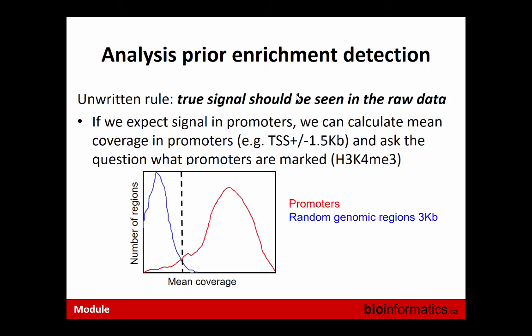It is a QC. Martin showed you the plots which have those bars, which tell us how many reads fall in the promoters of the genes. So after alignment, we have 20,000 coding genes. We take the transcription start site of every gene, step maybe 1,500 bases on either side, have a 3KB region, and check how many reads fall into all these 20,000 3KB regions.